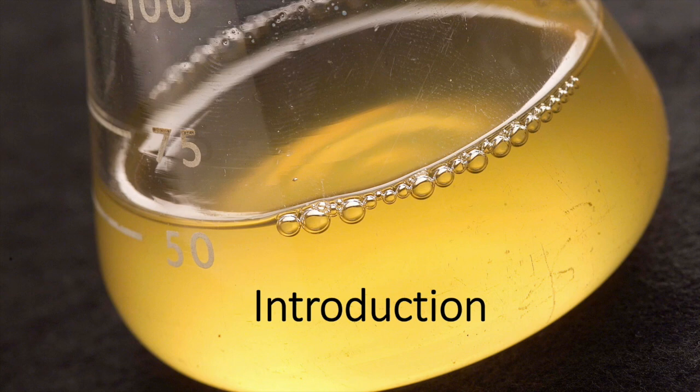Bioreactors and cell cultures are used in a variety of industrial processes. Understanding the kinetics of these systems aids in optimization of cell growth. E. coli is a suitable bacteria for investigation because of its consistent growth behavior and close adherence to proposed models.